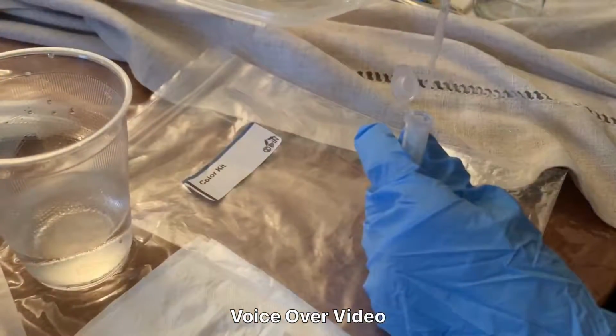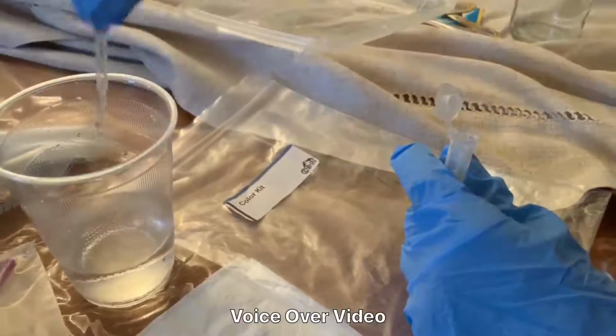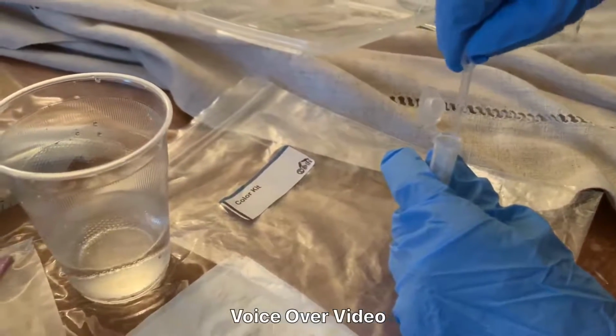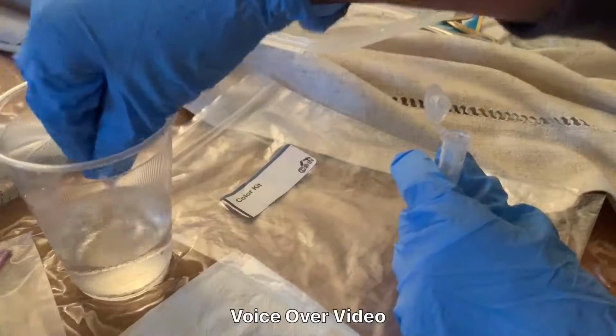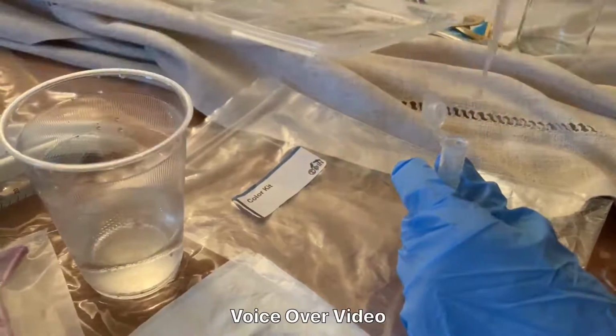I then took some of this water that was at room temperature and mixed it with it, and there was already powder inside this tube, so I mixed it with that. I did have trouble shaking it, but I eventually did shake it till there weren't any clumps or anything like that.